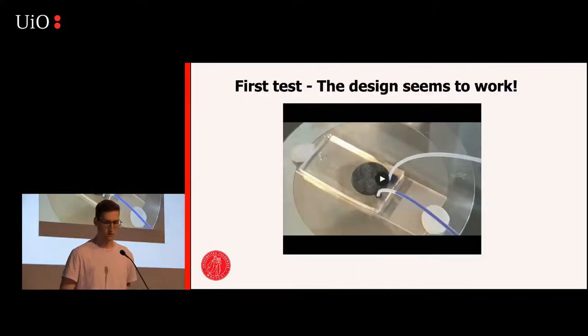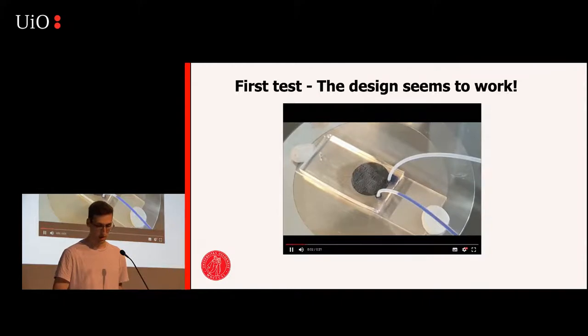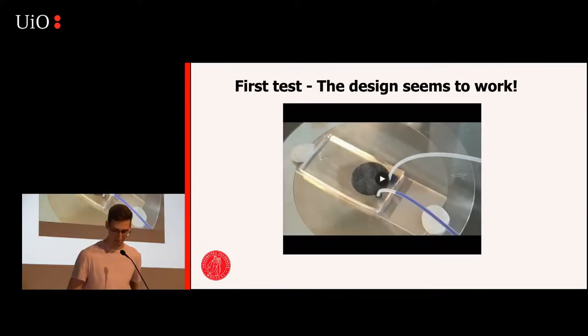All right, so here's one of the first tests we did of said microfluidic chip. You can see on the bottom, some blue liquid. On the top, you can see some air. And just watch how it fills the entire device. And as the air is coming in, watch the gradient generator do its magic. You can see on the top chamber how there's more air than in the other chambers. And you can see various concentrations of air to blue liquid. So the test worked, we're happy.